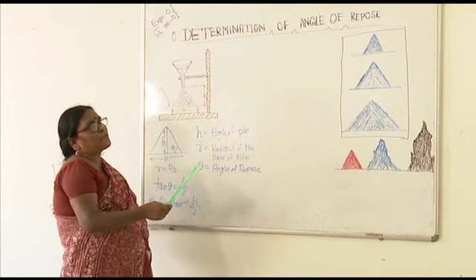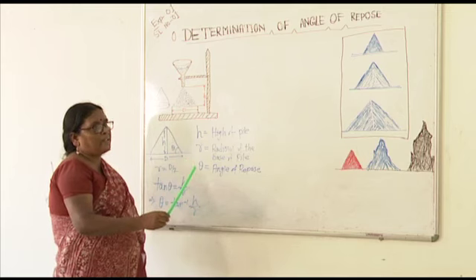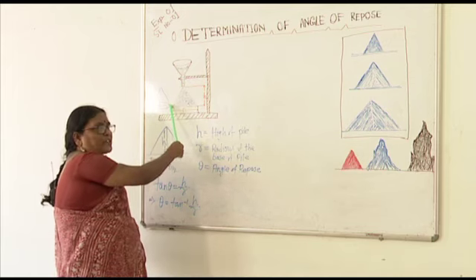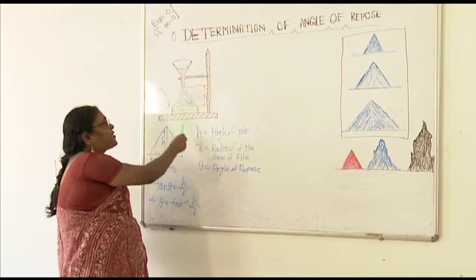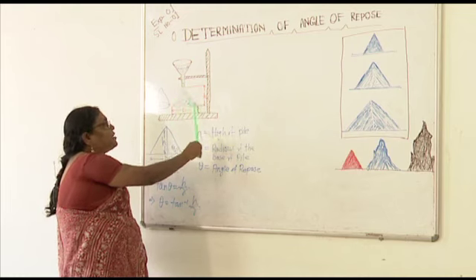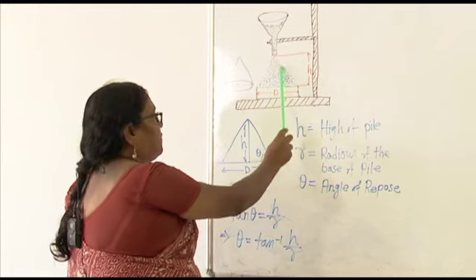You know that force, that is frictional force. So due to this frictional force, the flow is obstructed. Particles which come later and later will have more obstruction, and they won't be able to spread and form a flat surface. So they will be stopped midway, and that gives you the shape. So you don't get a flat bed, you get a slanting surface.